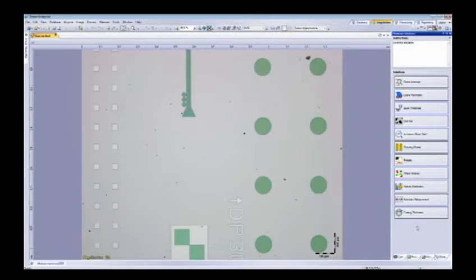Some of the features in the software, we have material solutions in the Stream software. These solutions are packaged and individualized for certain custom uses in the field. For industrial applications, we have grain analysis for metals and cross sections where they want to measure grain boundaries, grain patterns and widths. We have layer thickness measurements for cross sections of materials where they have layers that they want to measure. We have metal inclusions. Certain manufacturers of different types of metals want to measure their inclusions. All of these, including porosity measurements, are solution modules designed specifically for an application.